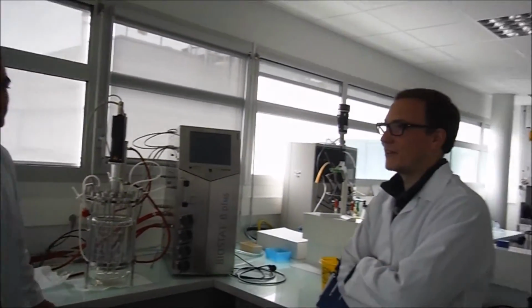Okay, thank you Laurent. In fact, the bioreactor is able to reproduce the living conditions of cells. The main parameters that have to be controlled in the bioreactor are the aeration, which brings oxygen to cells, and the agitation, which allows cells to stay in suspension and distribute the oxygen in the bioreactor evenly.